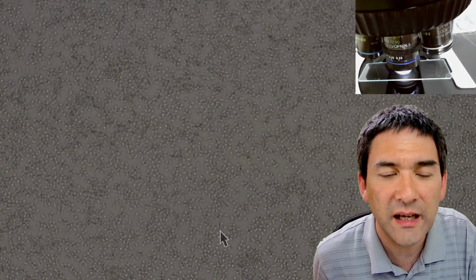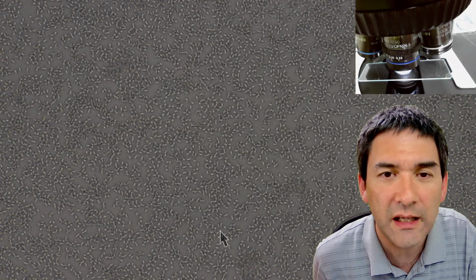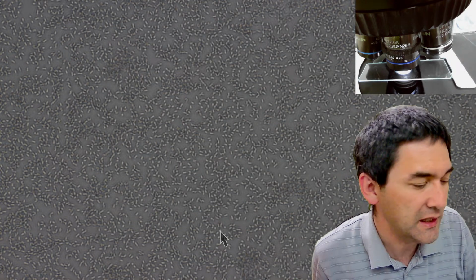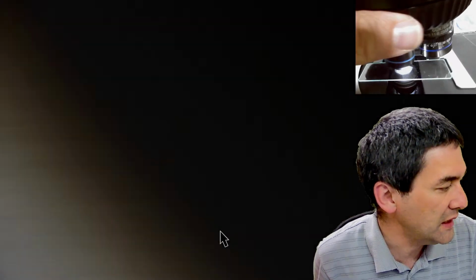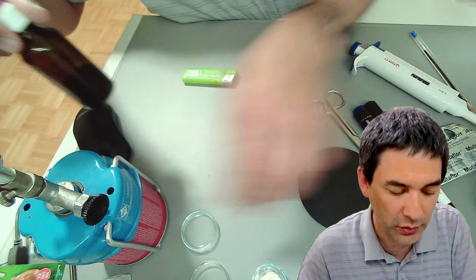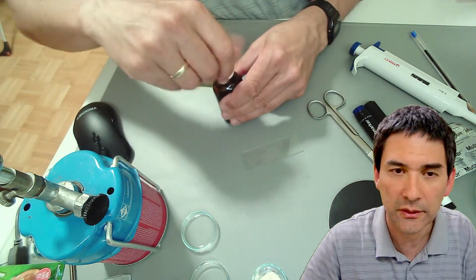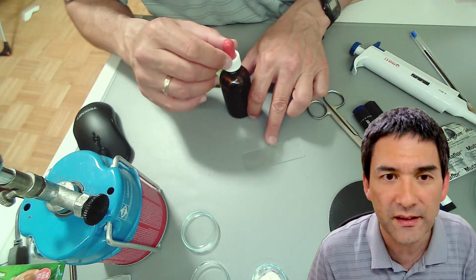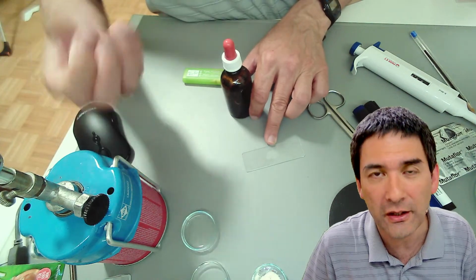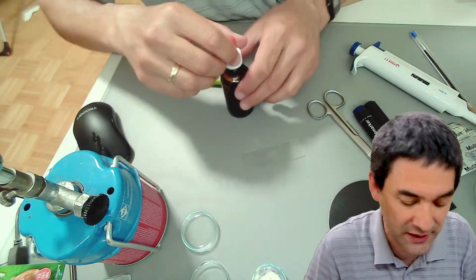And what I would say now is the following. Let's do a little bit of staining. What I'm going to do now is take out the slide. I forgot again some of my tissue paper that I need. I'm going to switch back to the desk view, and I'm going to apply a drop of Löffler's solution, which contains methylene blue, directly on the heat-fixed bacteria. Because they're heat-fixed, the stain will not remove the bacteria because the bacteria stick to the glass surface.